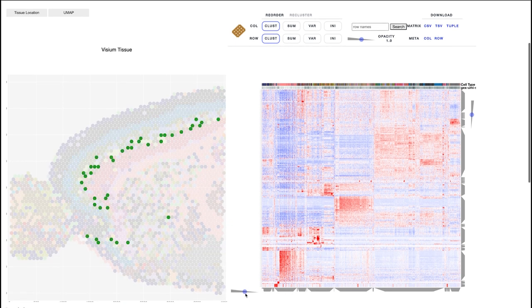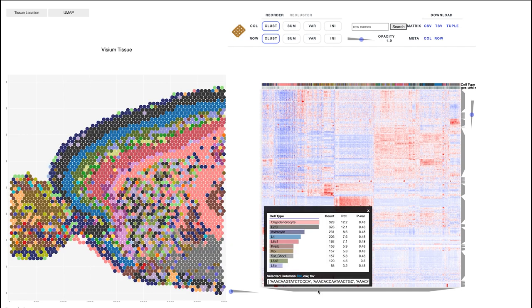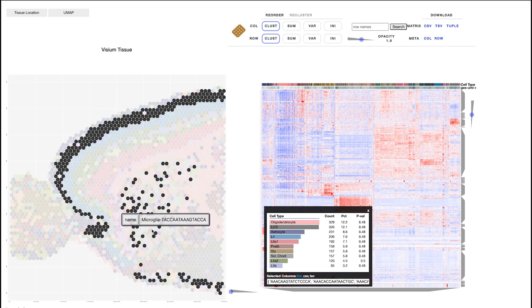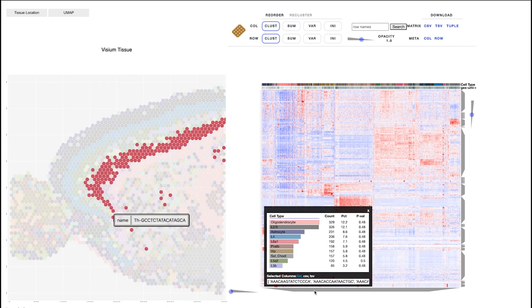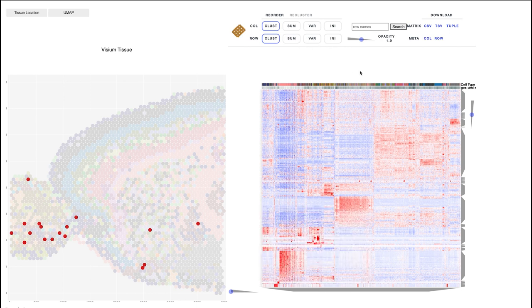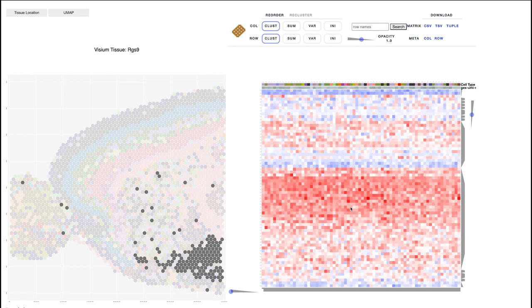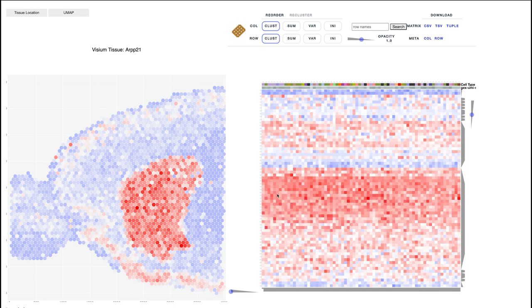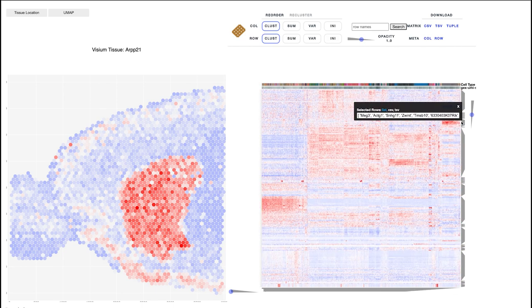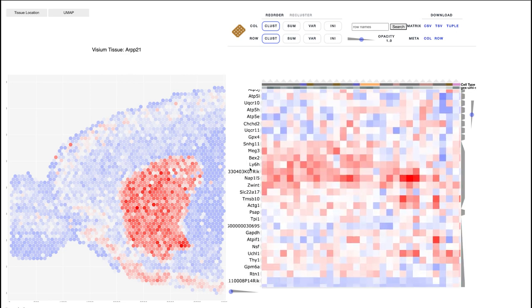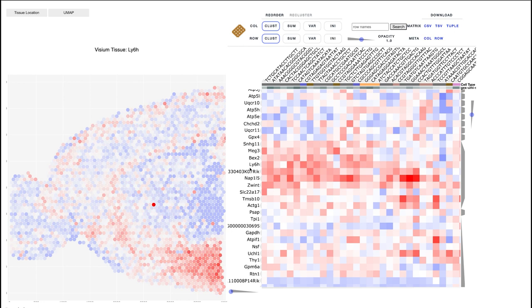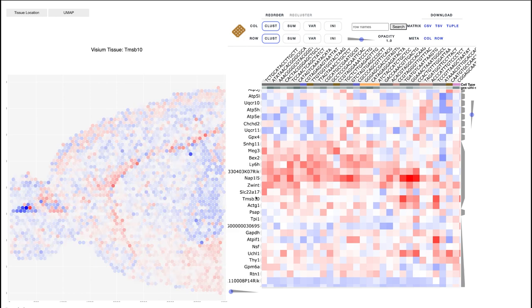You'll see a lot of similarities in the approaches. Similarly to the CityBike example, we actually know the physical location of these spots — each spot is a region of the actual mouse brain. The color is the predicted cell type for that mouse brain region. We have our cells as columns and our genes as dimensions. We can go ahead and click on a particular gene and see the expression of that gene in the spatial orientation. If you zoom in here, you can see all of these genes are highly expressed in that kind of middle region of the brain.